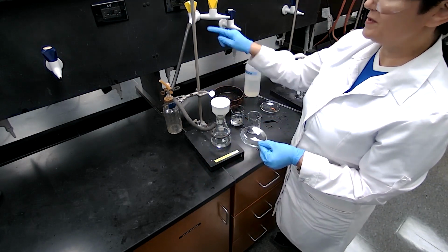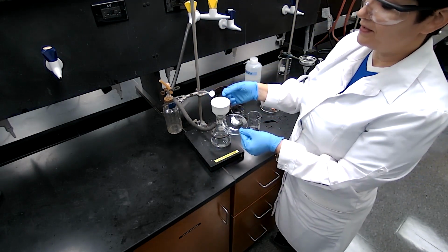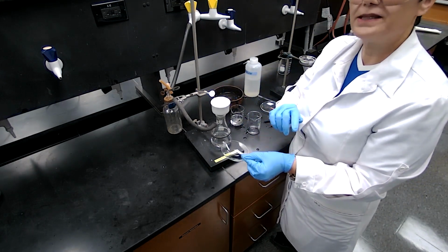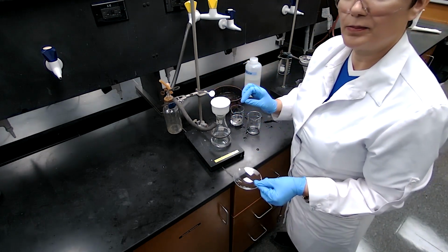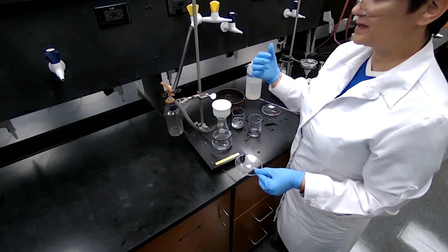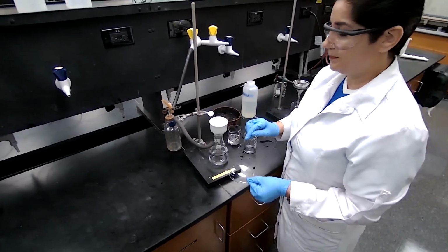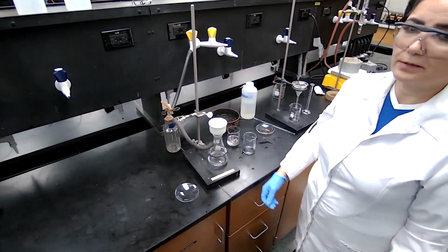I would transfer after the 5 minutes of vacuuming. I'm going to transfer the filter paper with the crystals into the watch glass and place it in the oven. The temperature of the oven is higher than the boiling point of the solvent that we are using, but lower than the melting point of the product. So I'm going to wait for the 5 minutes of vacuum.